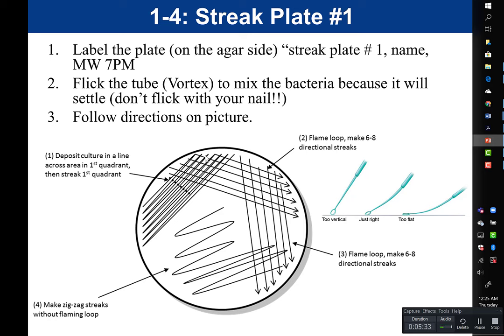When we're ready to do our streak plate, we turn it over so that the agar side is down, because we have to do our streaking on the agar. If we streak the lid, nothing's going to grow. So right before we start, we turn the plate over with the agar side down.